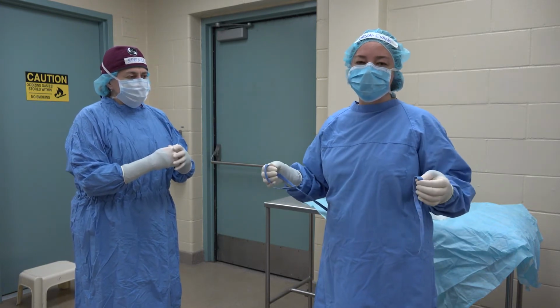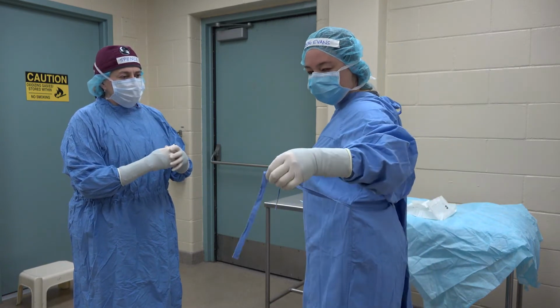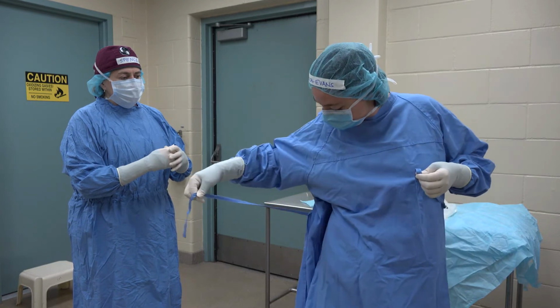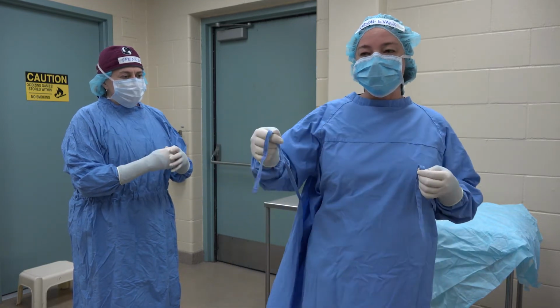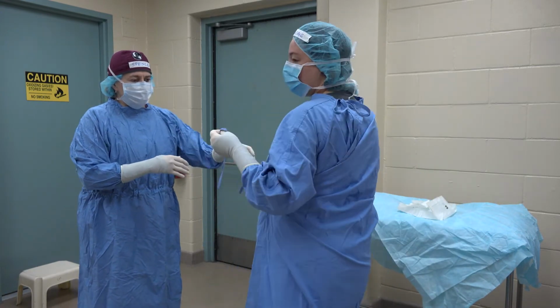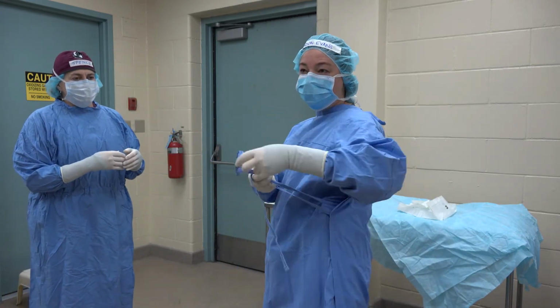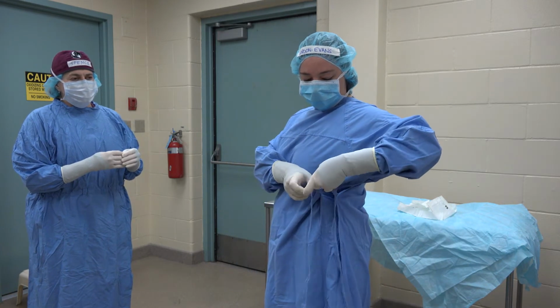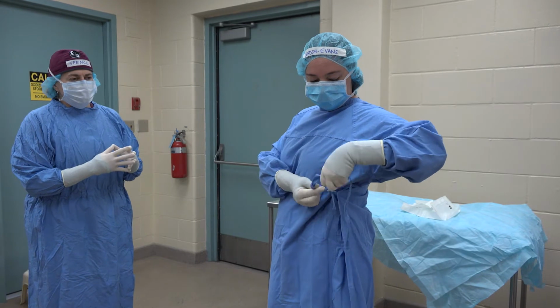Now, if you forget which side is which, all you have to do is look. So this side's attached to your side. If you pull on it, you can feel it. This side's attached to a big panel. That is the side you hand to your buddy, and then you turn. Ta-da! Now I have wrapped my backside, which is nice. And then all I got to do is tie a bow.